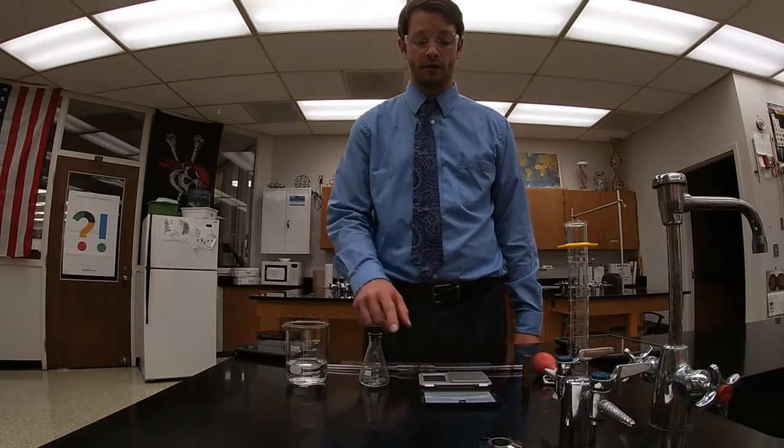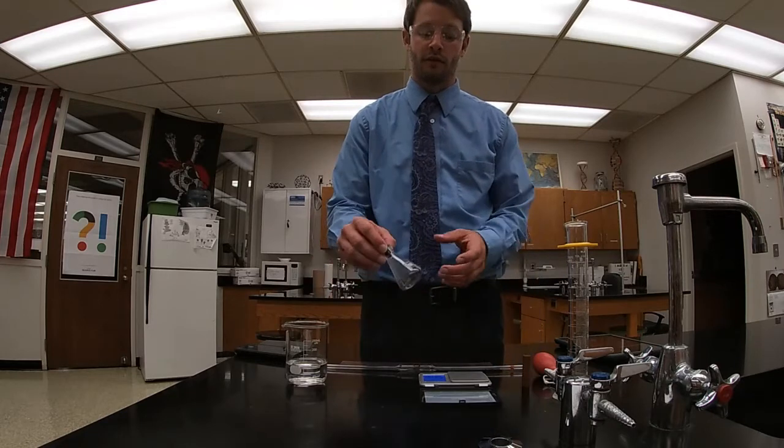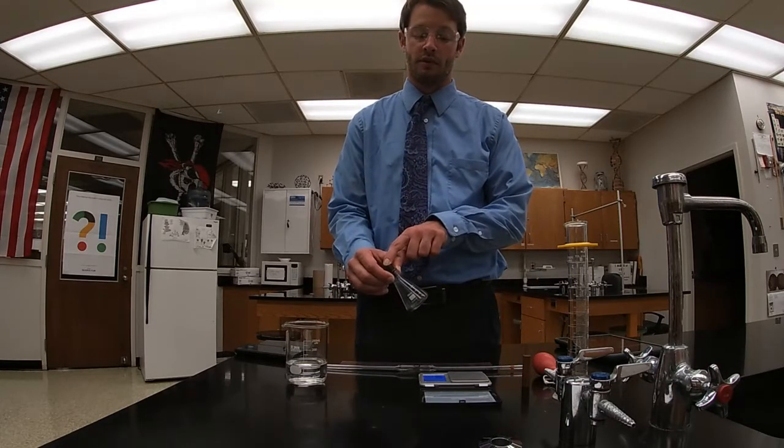For part one, you're supposed to take the balance and take the mass of your 50 milliliter Erlenmeyer flask with the stopper on it.